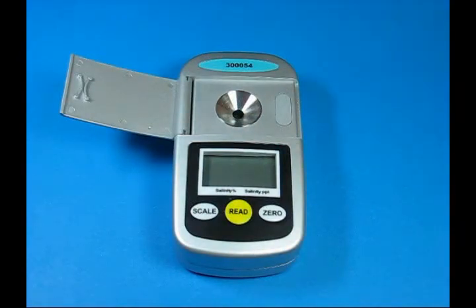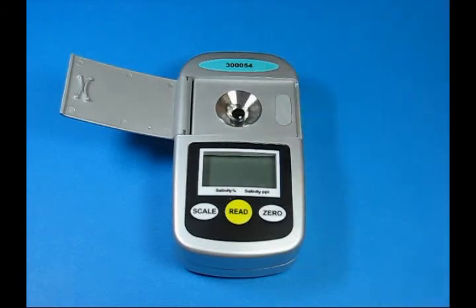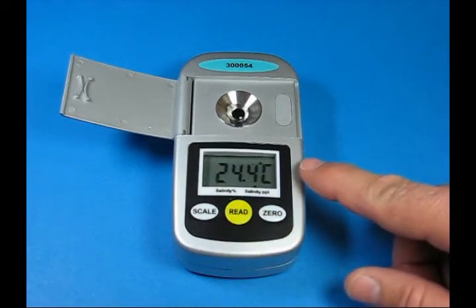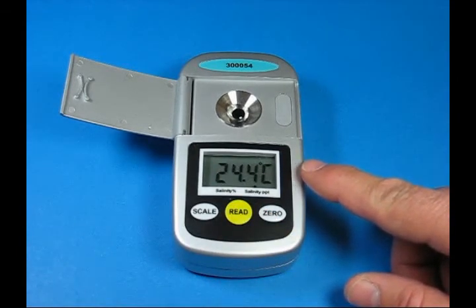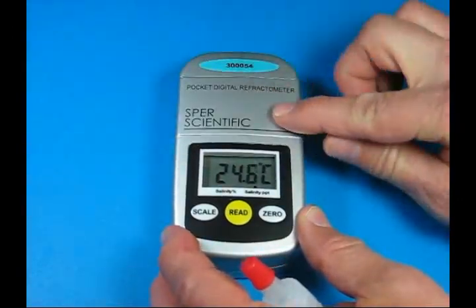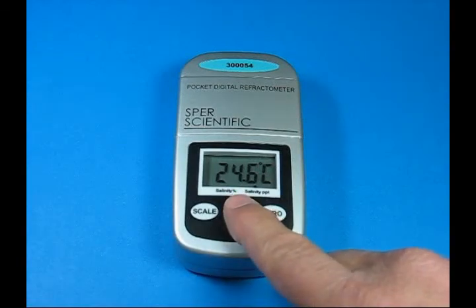To take a reading, we again only need a few drops of liquid. We put them into the lens — in this case a salinity solution. We turn the unit on by pressing read, and first read the sample temperature. We then close the door to make sure that no outside light gets in, and we get an accurate reading.